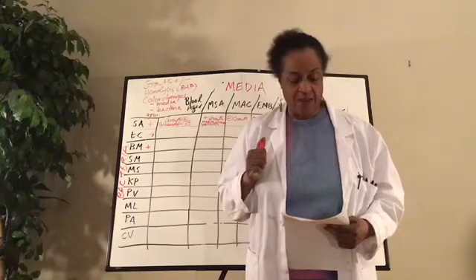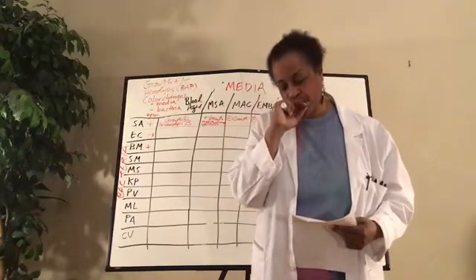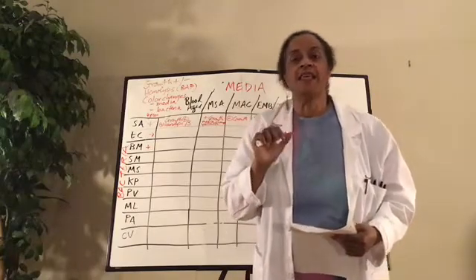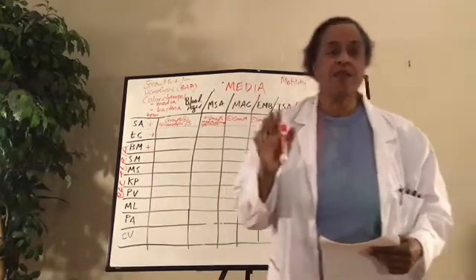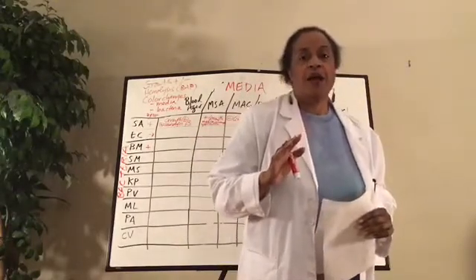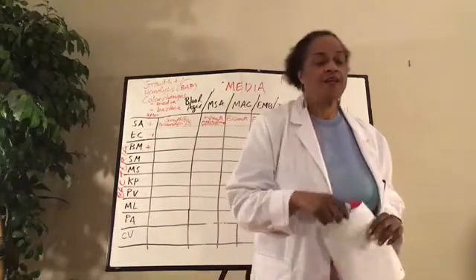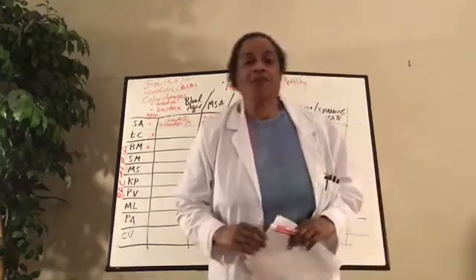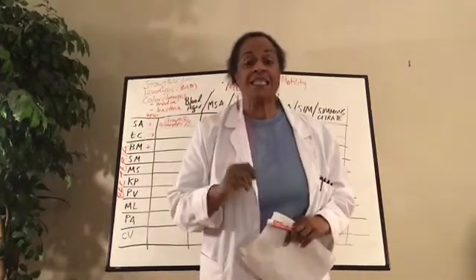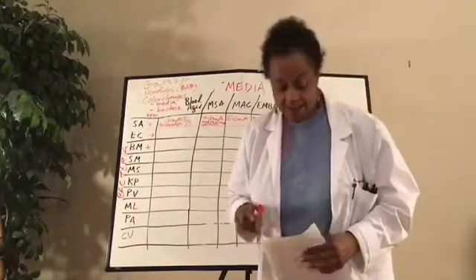Please remember that we're going to incubate the test tubes and the plates at 37 degrees for about 24 to 48 hours. Sometimes in our book it says 18 to 48 hours, whatever. Just incubate it long enough so we get some growth. Remember to invert them, to make them upside down, so no condensation occurs on the bacteria on the media itself.